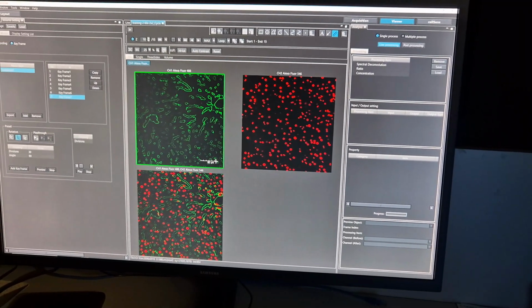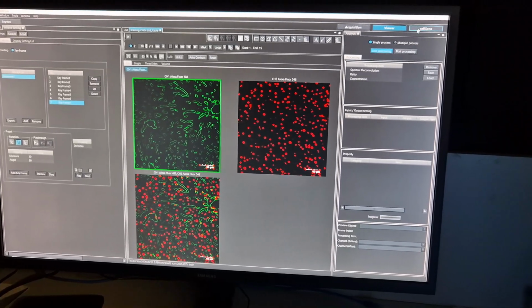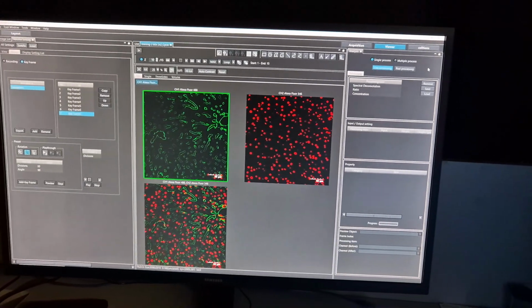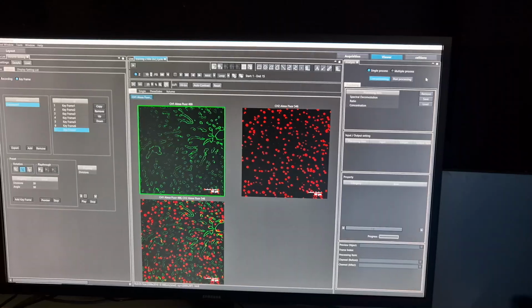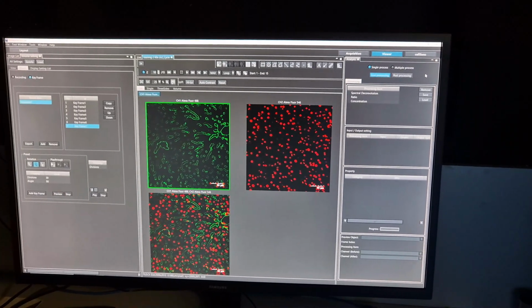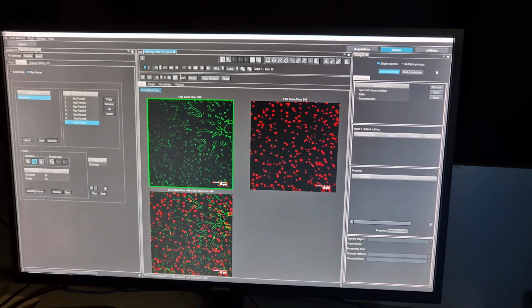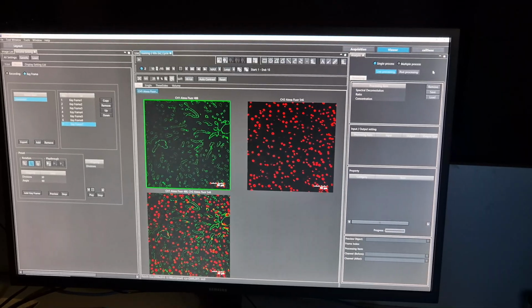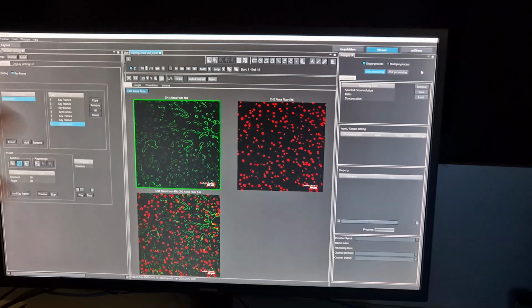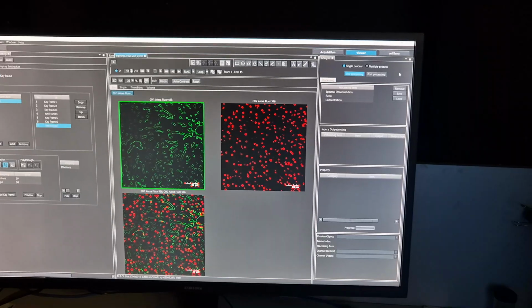This is a pretty rudimentary scale bar, but we've got CellSense. This is another software, which is an additional license, that does so much. Not only can you add annotations, scale bars and lots of things like drawing objects, but it does a whole bunch of analysis, and it does it very simply. You just get an eyedropper tool and start painting what it is you want to measure. Everything on the screen like that, the color, the shape, the channel, starts to get highlighted.